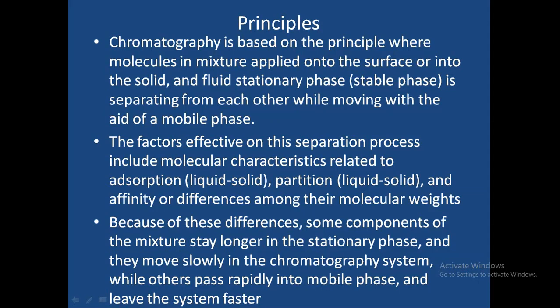Adsorption is adsorption chromatographic type. It uses solid as a stationary phase and liquid as a mobile phase. And in partition there is a liquid and solid phase. And affinity, again you should have both the mobile as well as stationary phase.